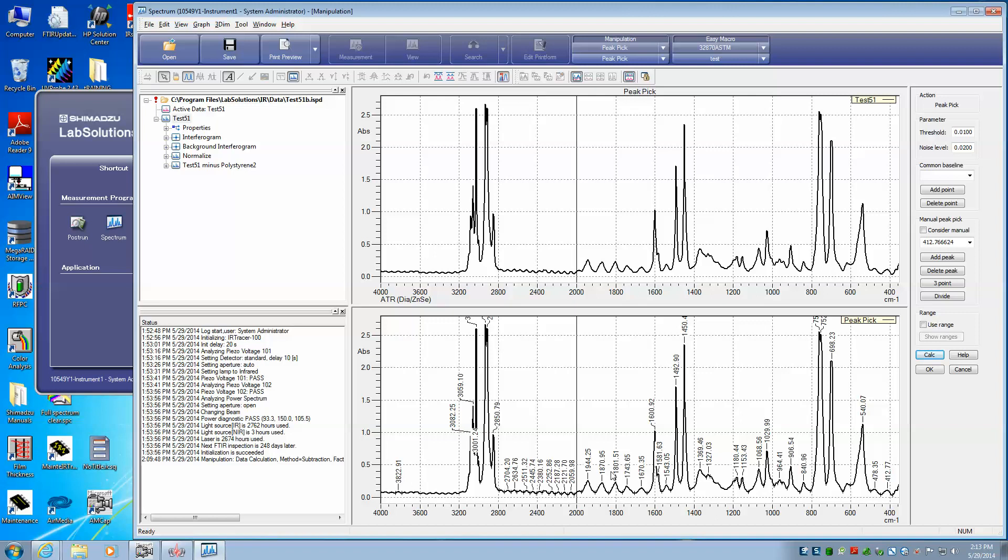that will probably keep these wagging bands here but eliminate that. So let's set our threshold to .2 and calculate again.